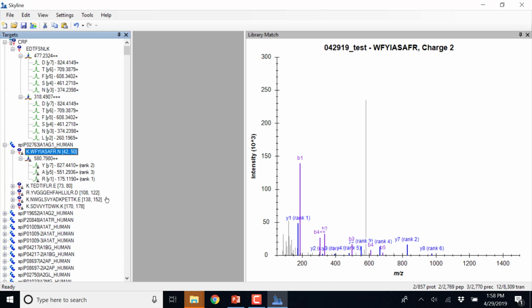But I disagree. Does anyone know why I disagree? It's not only too small, but for this peptide, it's arginine, right? When you digest a whole sample with trypsin, about half of your peptides end in arginine and half end in lysine. So the selectivity of picking Y1 of arginine is very poor. Usually if you pick product ions, the higher the mass to charge you get, the more selective it is, because only a certain number of amino acid combinations can fit to make that mass to charge.